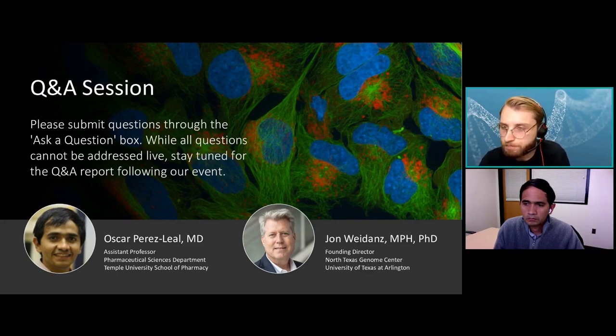All right, Oscar, I'll direct this next one to you. So what types of cell lines have you been able to modify with the FAST-HDR system?